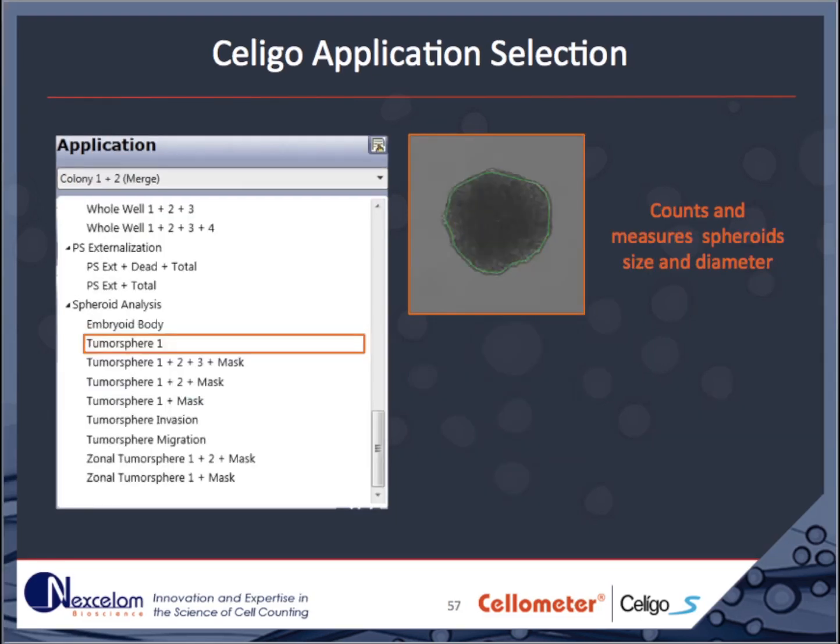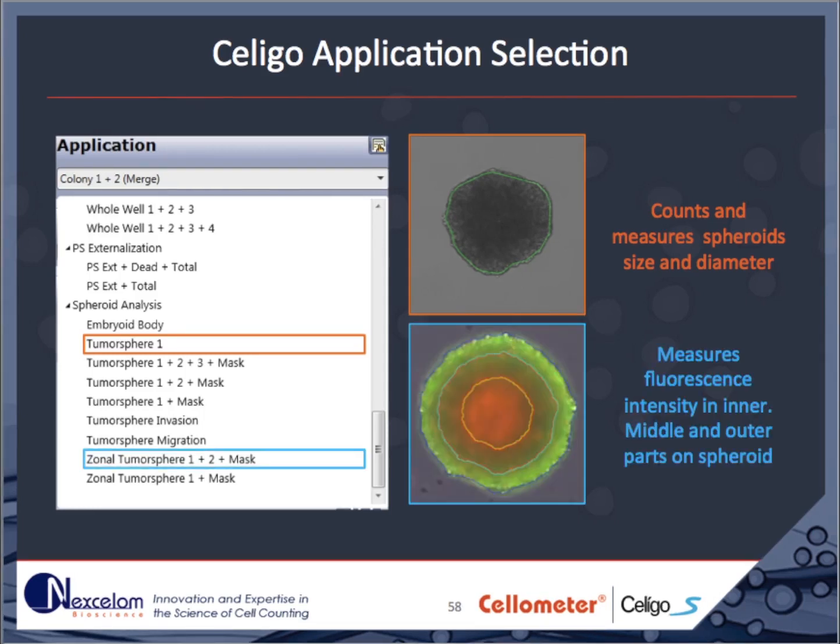The Soligo software has a suite of assays designed for imaging and analysis of multicellular tumor spheroids. The Soligo can detect and measure multicellular tumor spheroids in brightfield images. Spheroid health can be monitored with fluorescent agents, and the extent of staining can be monitored either in each channel independently or reported for the inner, middle, and outer zones.